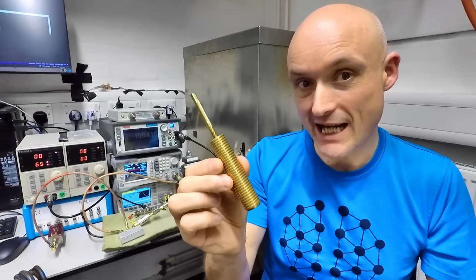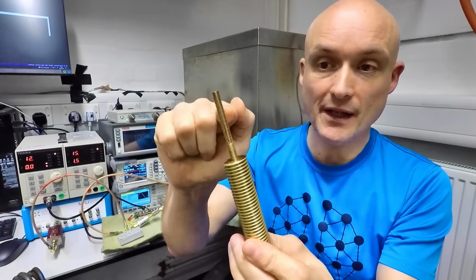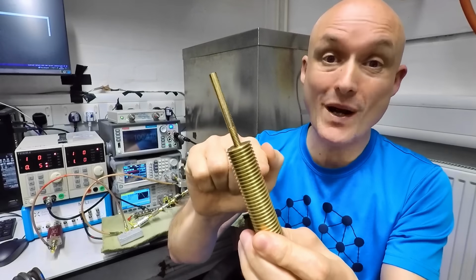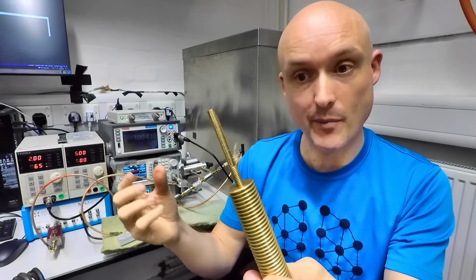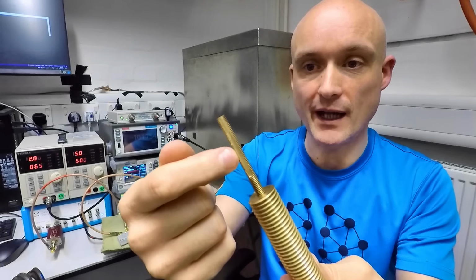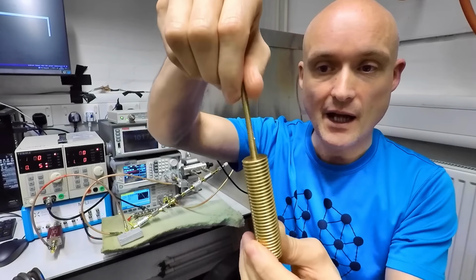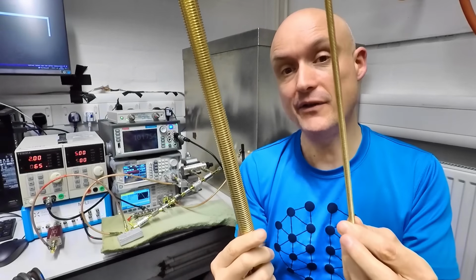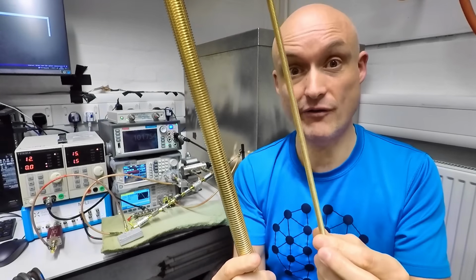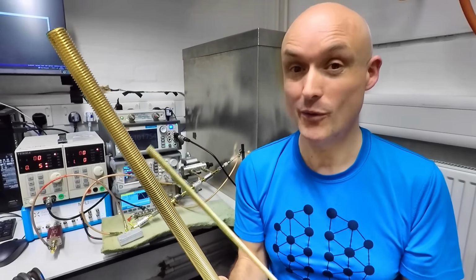Now here is a naked version of the differential screw. As you can see, it's a 6mm threaded brass bar into a 20mm threaded brass bar. We designed this on Autodesk Inventor, just like we did the other parts. As you can see, it's got slots machined into the 6mm. That fits into our 3D printed piece, and that turns inside the 20mm threaded bar. And it was made using these two purchased brass threaded rods, a 6mm and a 20mm. But putting those together into something that works was actually quite a feat.